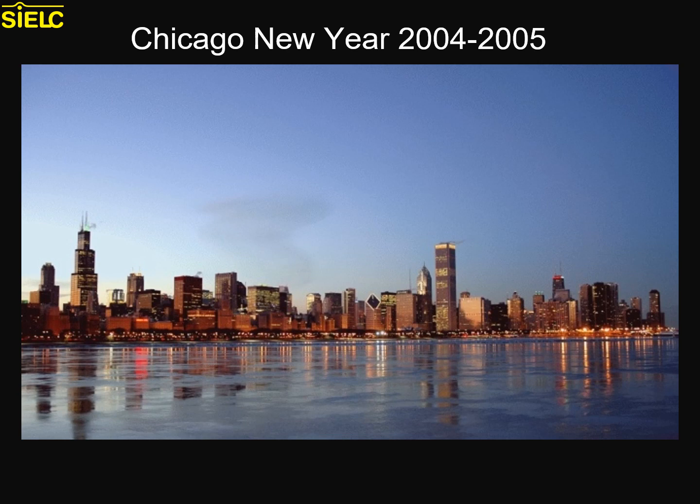And you can think of separating compounds on a column by looking at this picture. This is the Chicago city skyline at the turn of the new year in 2005. And in particular, you should draw your attention to Navy Pier on the lakefront. You want to draw particular attention to the light shown here and think of it as a column. So the light is brightest on the lakefront where the light first hits the water.